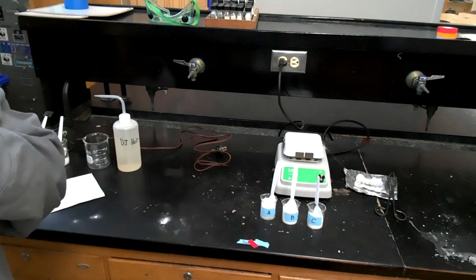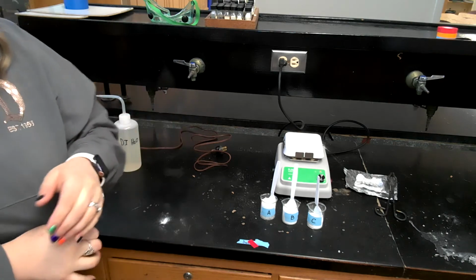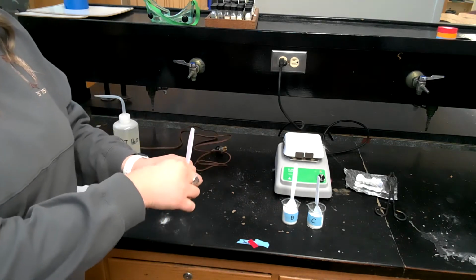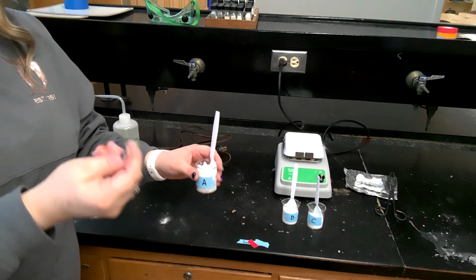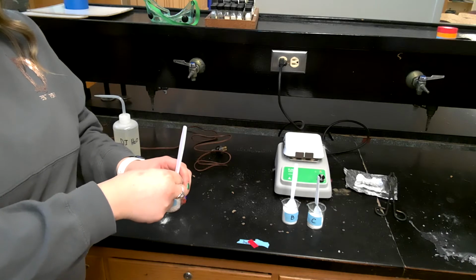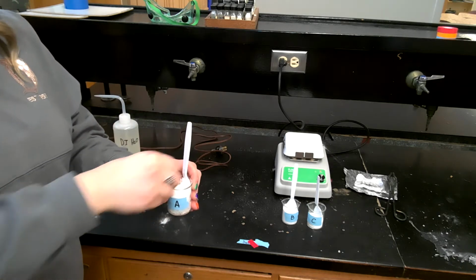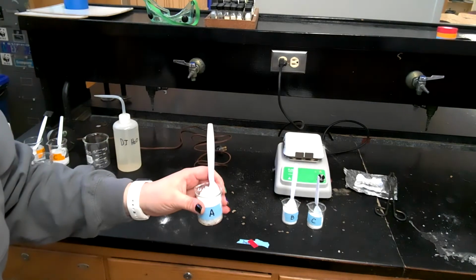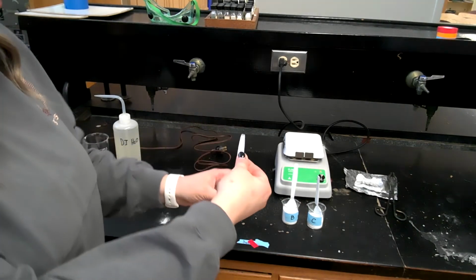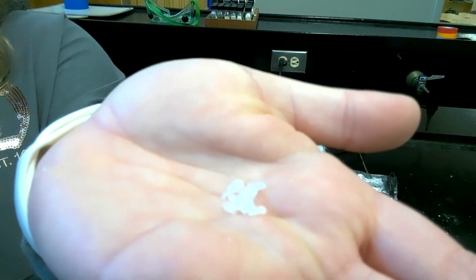One of the things that I always tell my students to do when they do this lab is to observe the appearance, and maybe even, this is one of the very few labs where you get to actually touch the substance. So I actually want them to look at it, describe a lot of physical characteristics about these substances. So what we have here for substance A, if I zoom in a little bit.